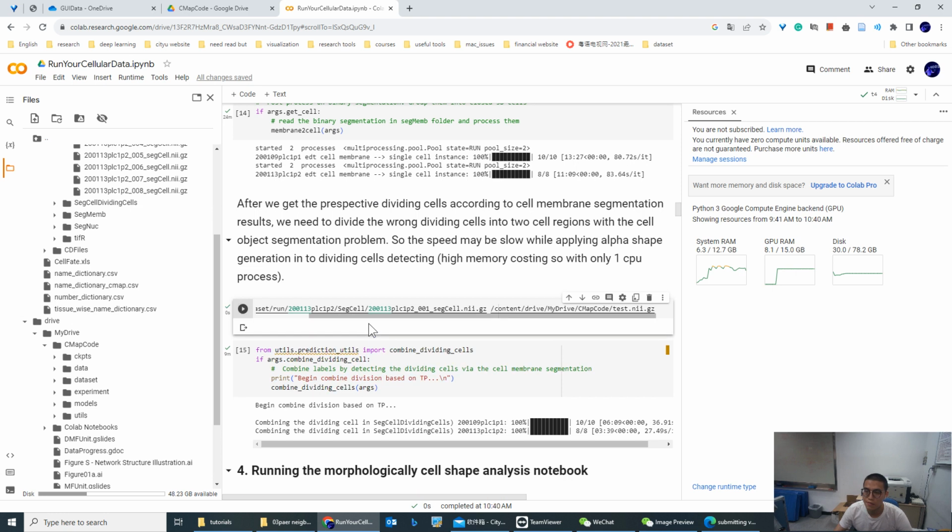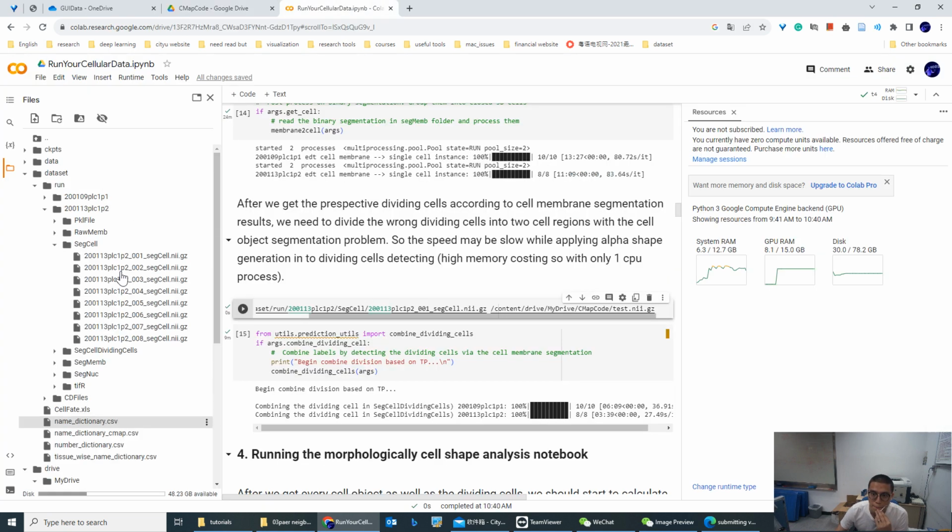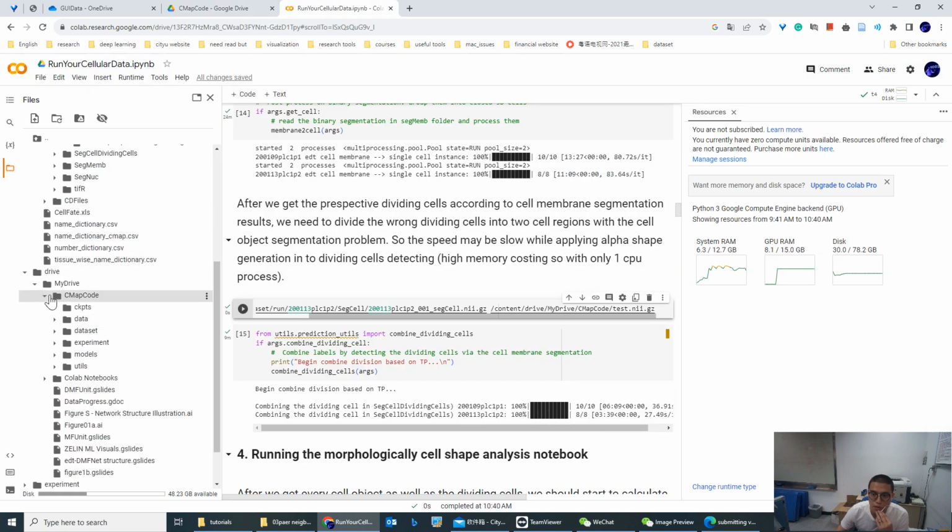Run it. Then copy here and refresh that folder.